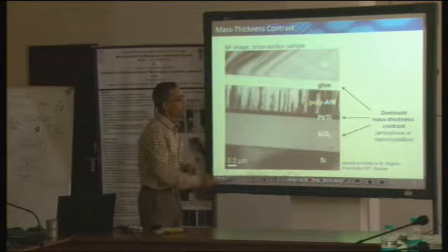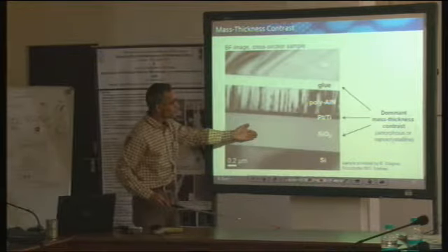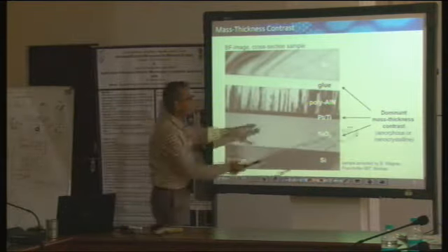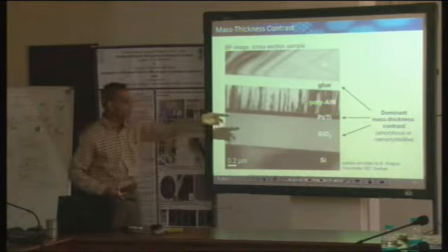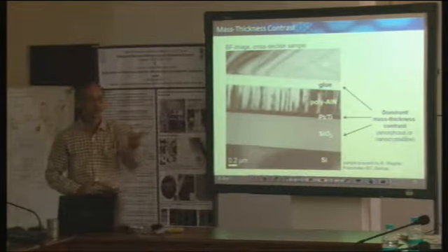So this has to do with the mass thickness contrast, which is the one which is dominant. This part is amorphous, this part is also amorphous, we know, and what the platinum titanium is, I really don't know. But in any case, it is probably the dominant term. Even if it is crystalline or nanocrystalline, the mass thickness contrast of platinum and titanium, which as you know are heavy elements, is at least dominant. The glue is some kind of carbon material, a polymer again probably, a light element.